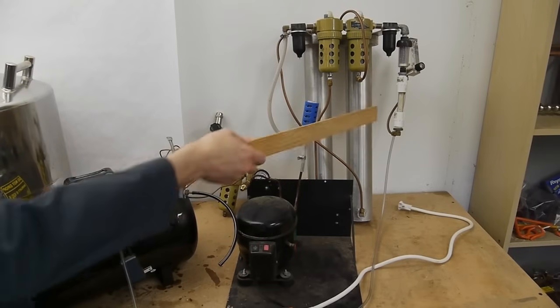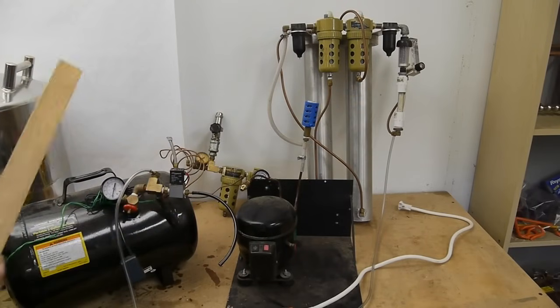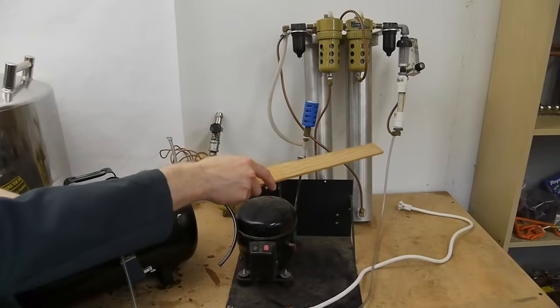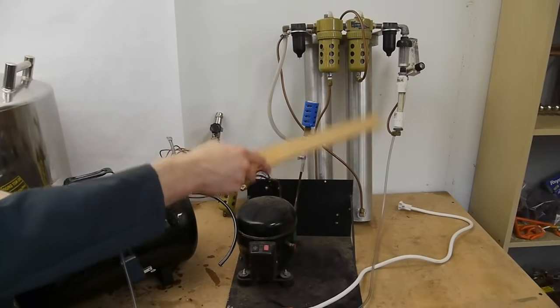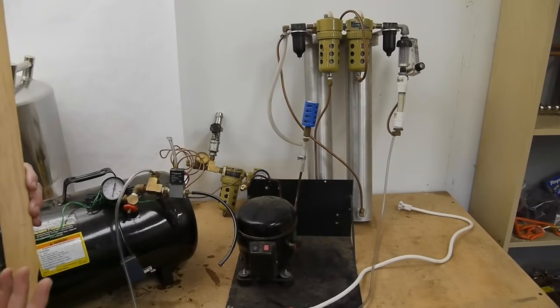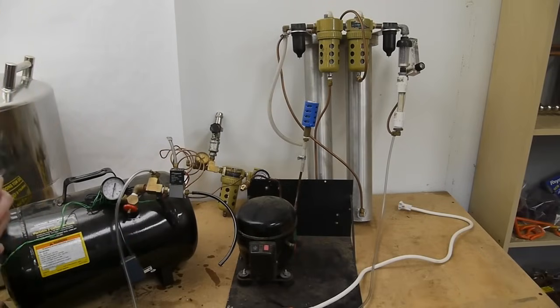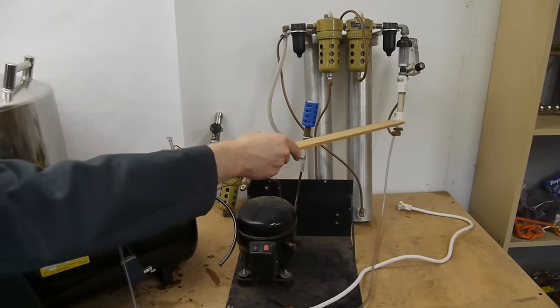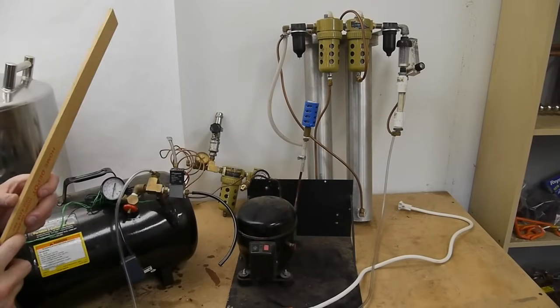By playing with the flow rate through this and the pressure differential you can sort of decide how much nitrogen purity you want. So slower flow rates mean that the oxygen has more time to escape and then you can pick off a higher quality nitrogen stream out the end.